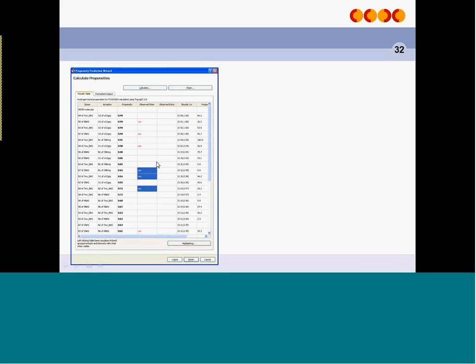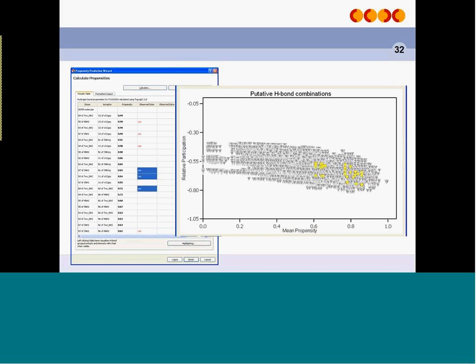We run it through the hydrogen bond propensity tool. Again, we have 3 nice strong interactions at the top, same interactions that were present in the previous polymorph, but these mid-table interactions are starting to look a little bit better. In general, they have higher propensity values. And again, if I click on those interactions and show them in the chart, what you can see is that we certainly move down to a more stable area. Some of these structures are looking like really very good prospects indeed.